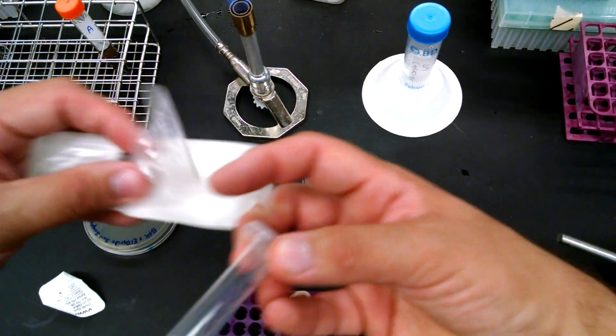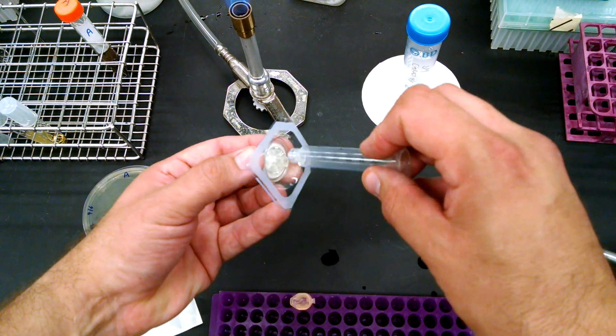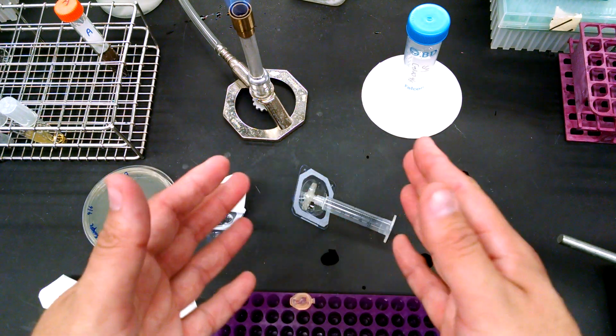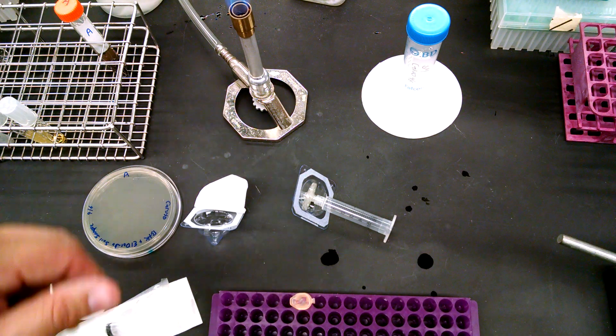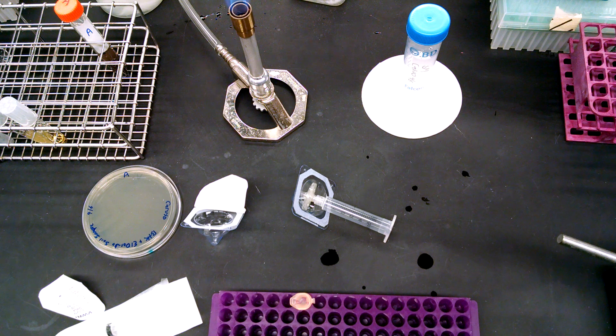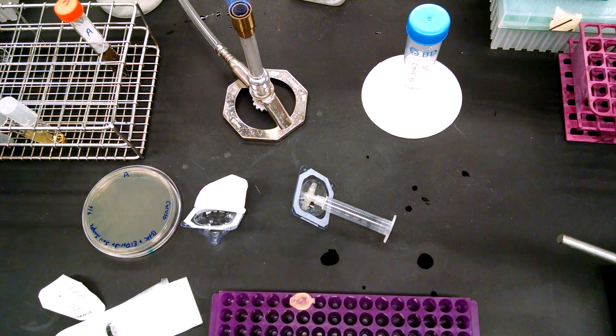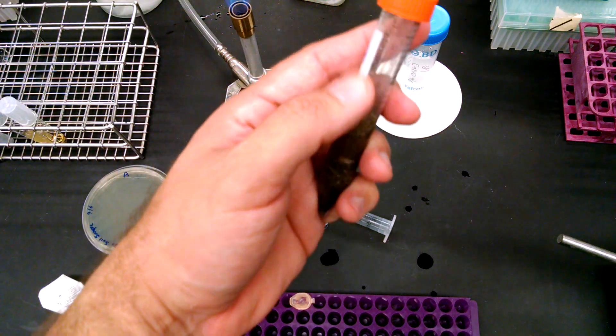We'll take the syringe, pull out the plunger and then put it back in here. Keep that clean and attach the barrel. Now you can do this with a one mil or a three mil. I'm just showing you both. And then we'll just take a pipette.